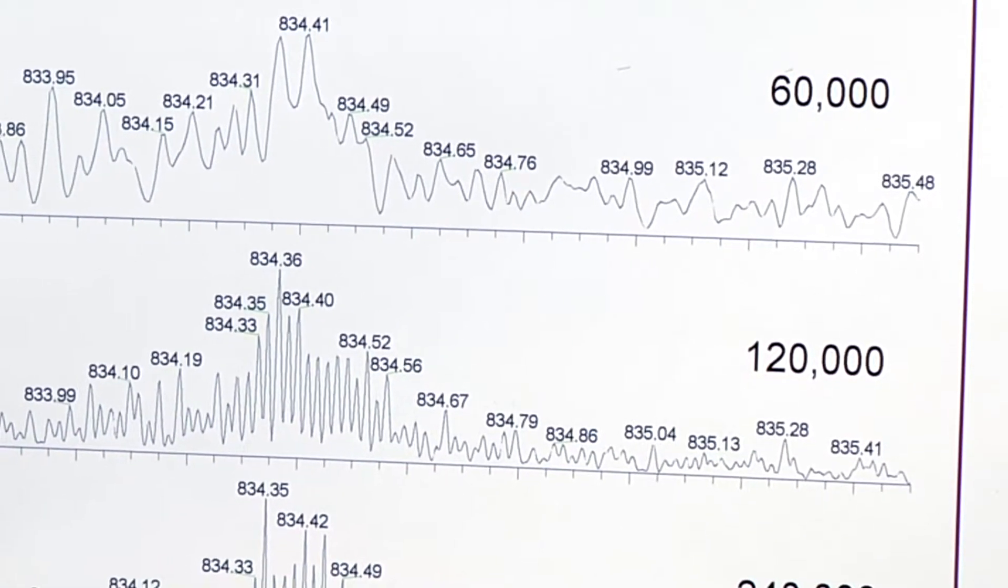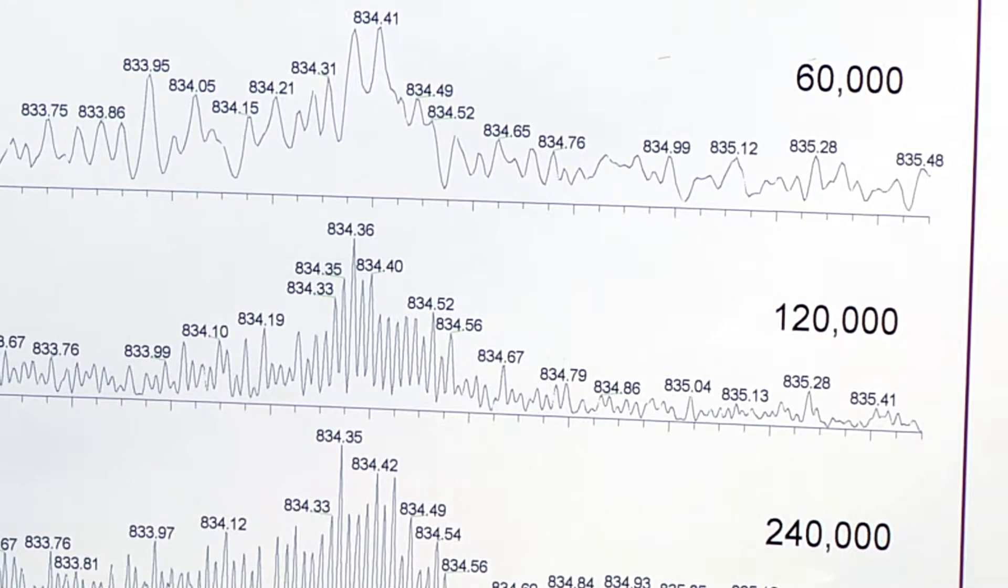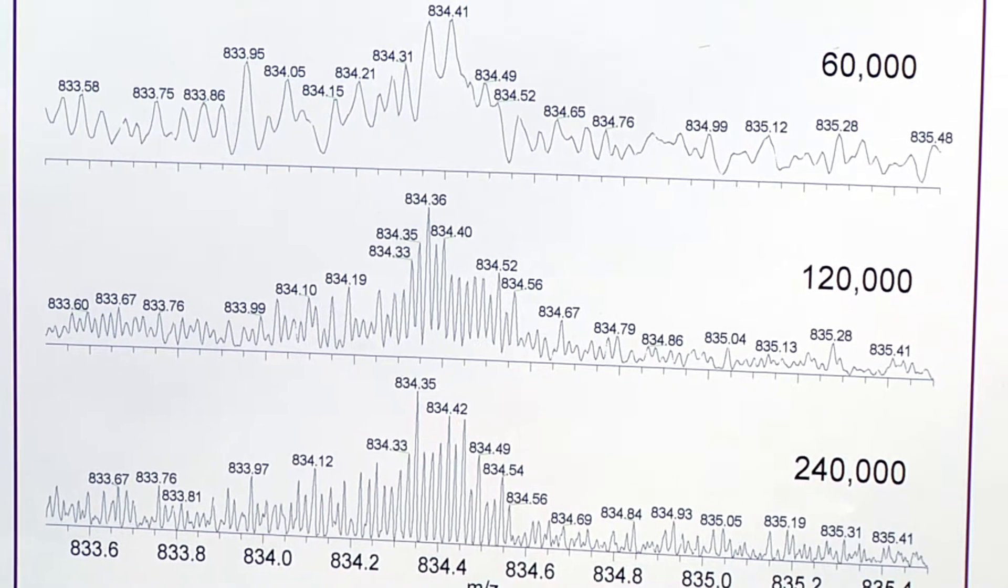And that's shown right here. So 60,000, you can't really resolve the isotopes for enolase at all. 120,000, it's a little bit resolved, but 240,000, we're getting baseline resolution for those isotopes.